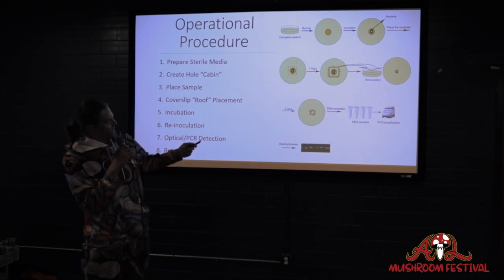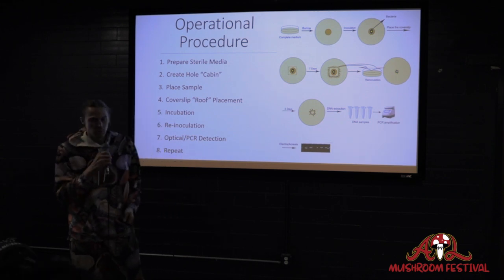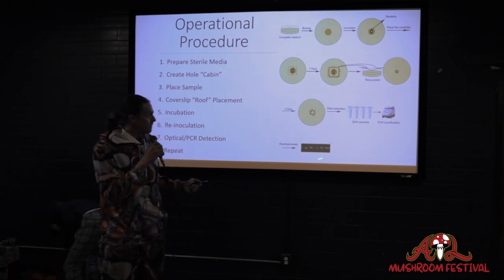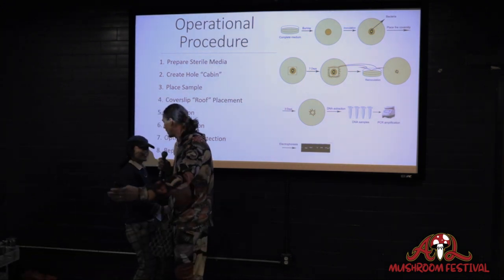And then after about 7 days, the culture would grow through the agar to the edges. A sample was then taken and put on to a new plate, and then DNA extraction was done a few days later in order to go and amplify the DNA of the contaminated culture to see whether it was present or not present.